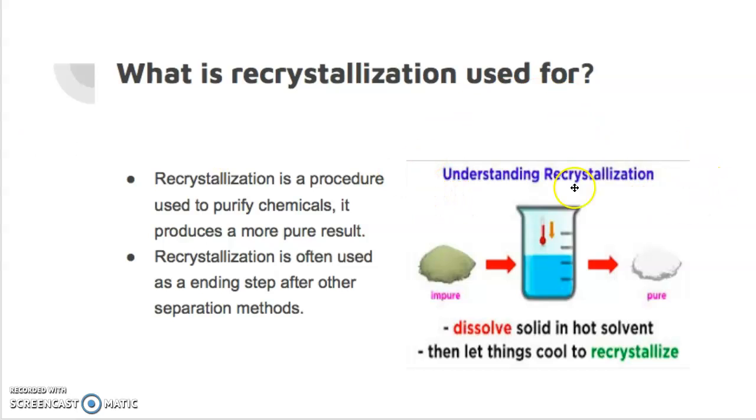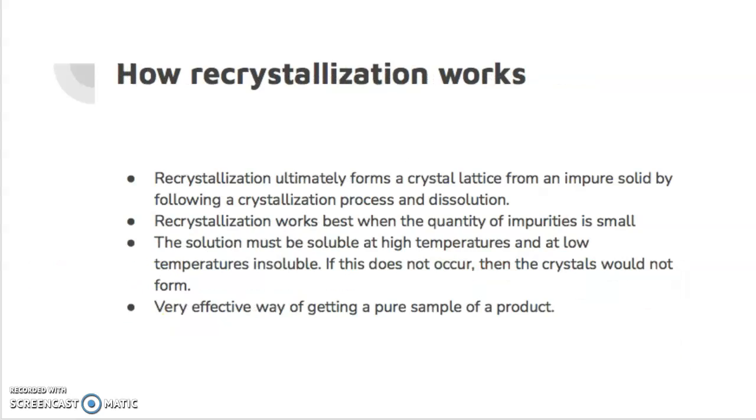And here I just put an understanding recrystallization photo, and it's talking about the steps, but I'm going to go into detail about those later in the PowerPoint. How recrystallization works: recrystallization ultimately forms a crystal lattice from an impure solid by following a crystallization process and dissolution.